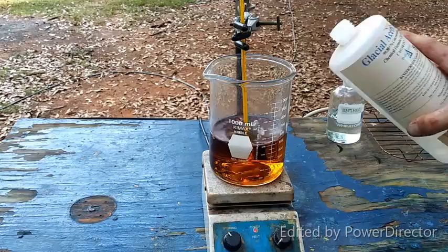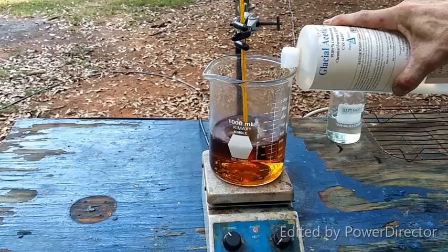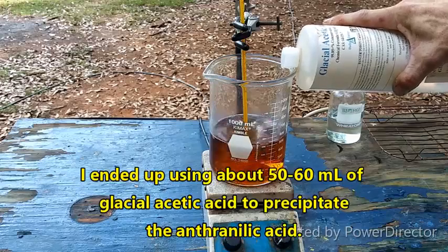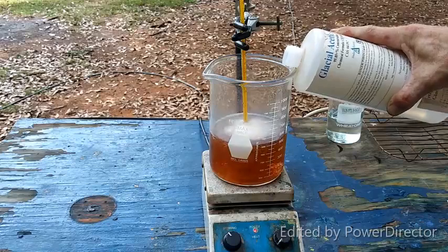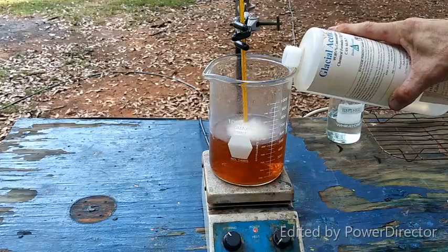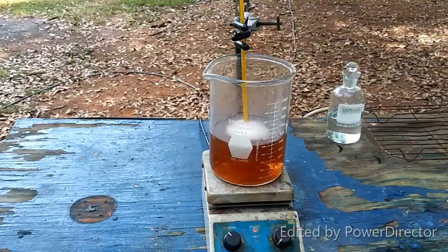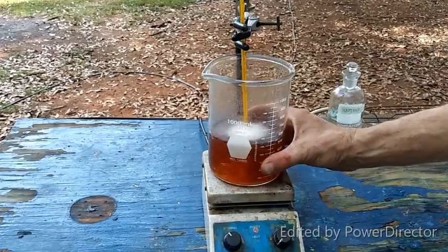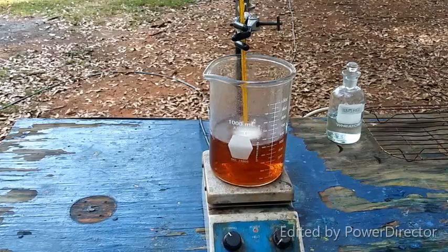So now, we're going to add glacial acetic acid, and this should precipitate the anthranilic acid. Now, when I did this yesterday, it didn't. But we'll see. We want to do it just a little bit at a time here. And you have to use glacial acetic acid for this step in order to get the anthranilic acid to precipitate.